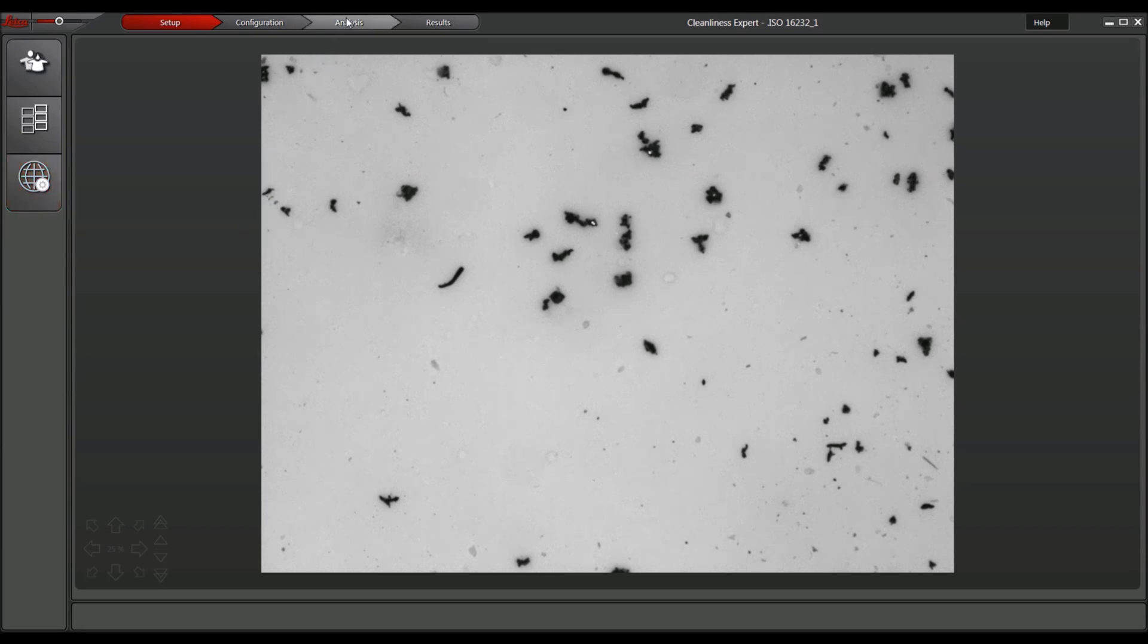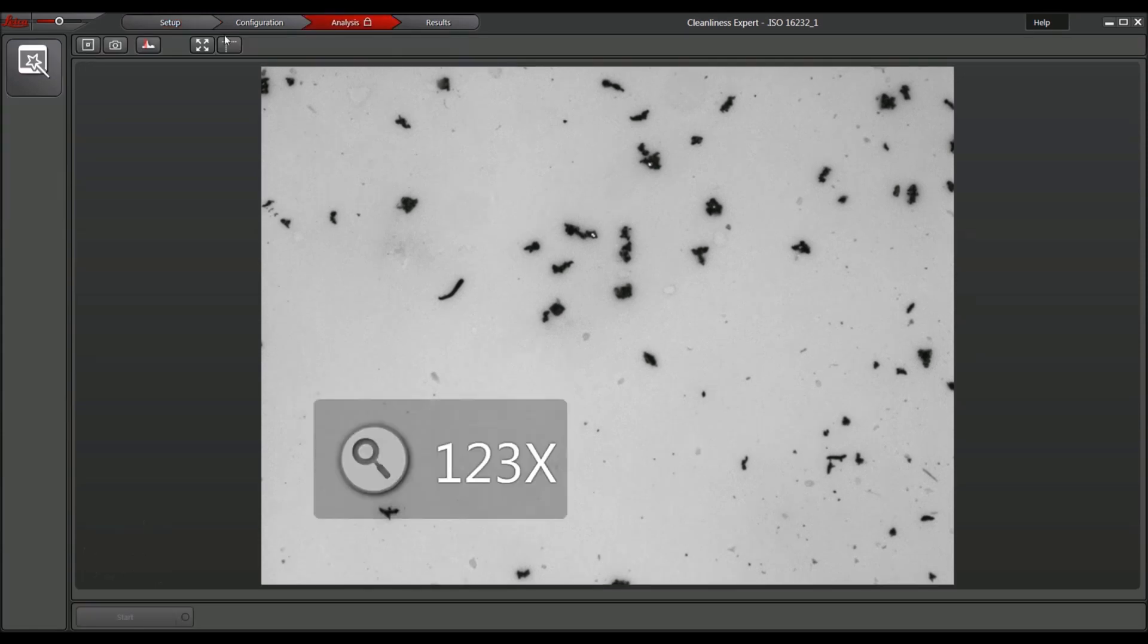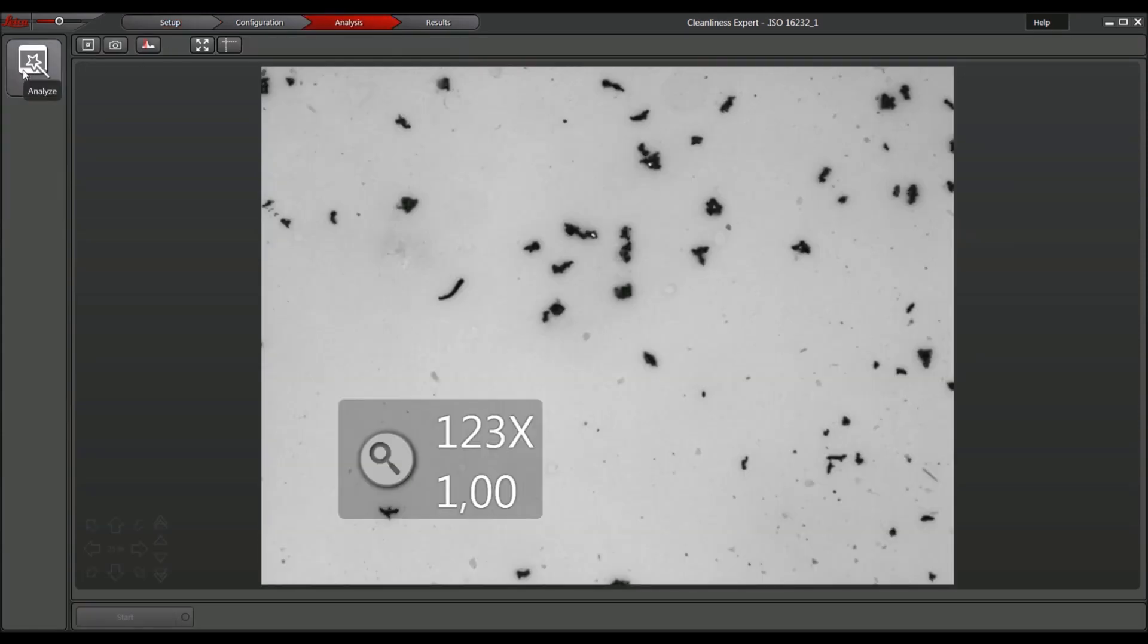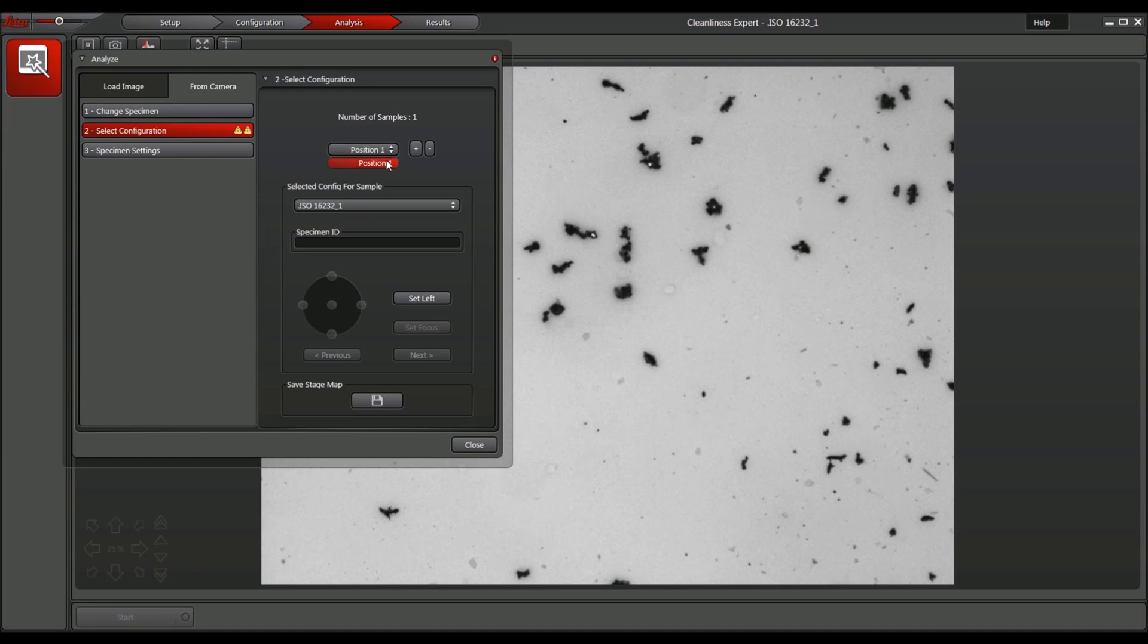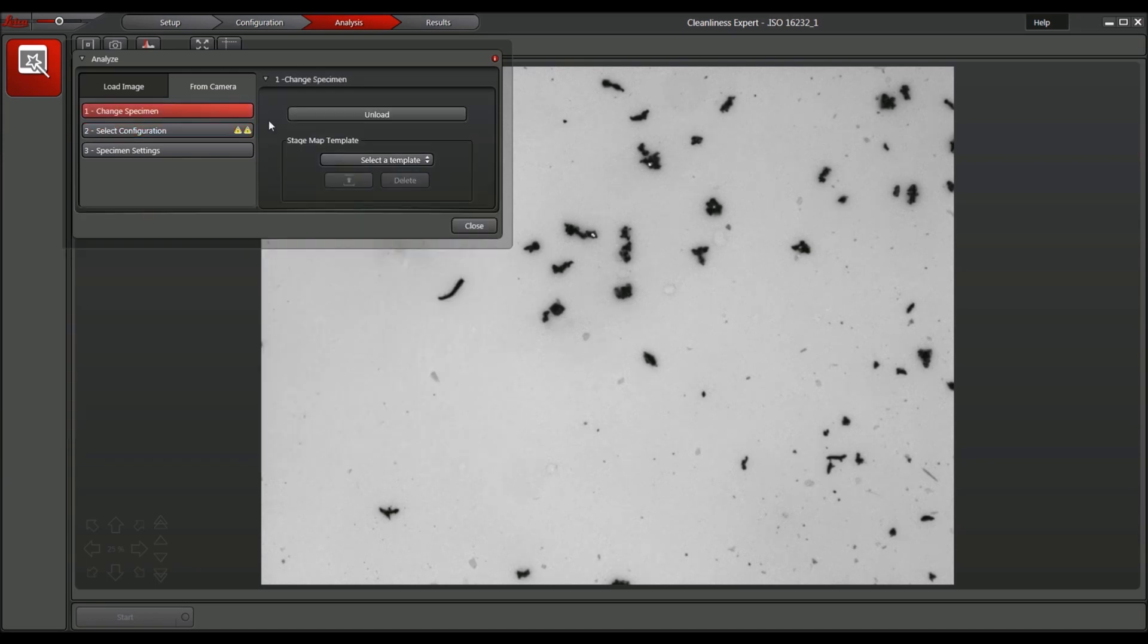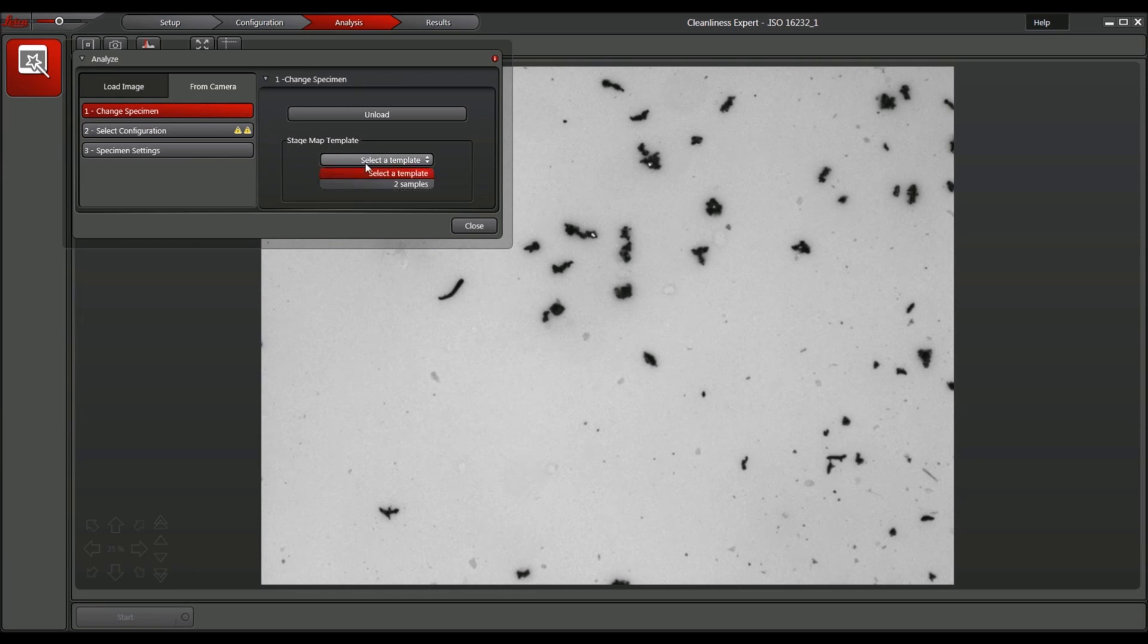Go to the Analysis tab and select the icon to start a new workflow. To add samples, simply click the plus icon or select a template predefined by a user. With the template, the number of samples and their stage positions are automatically loaded.